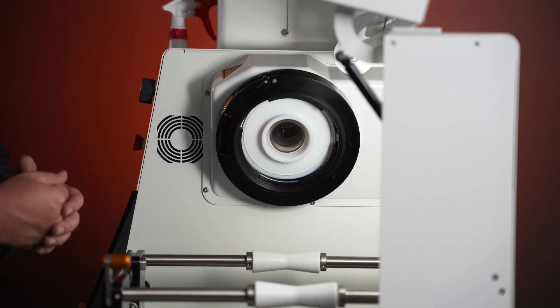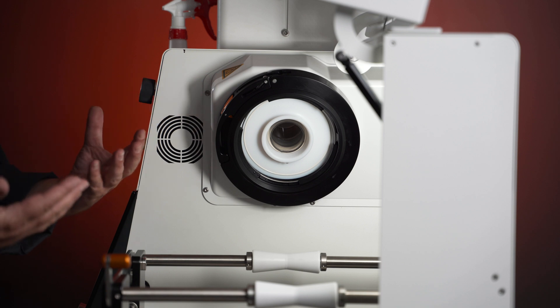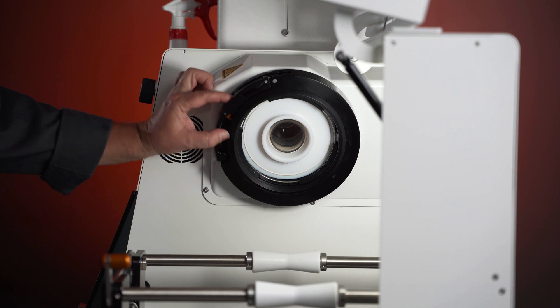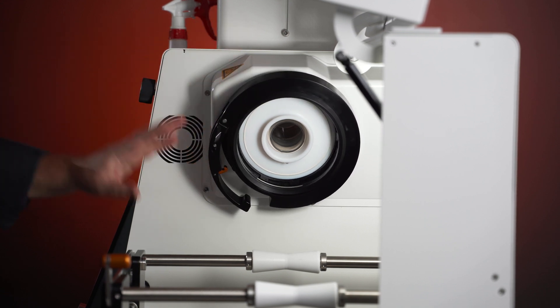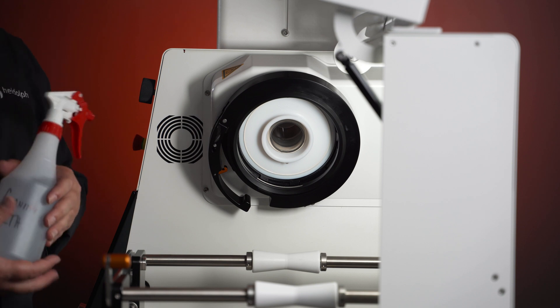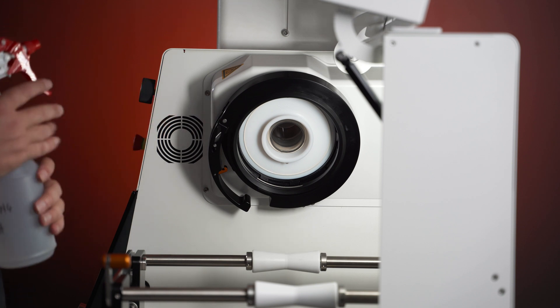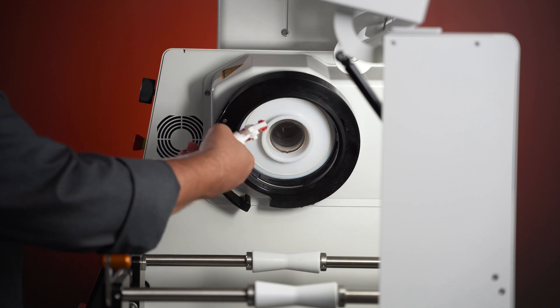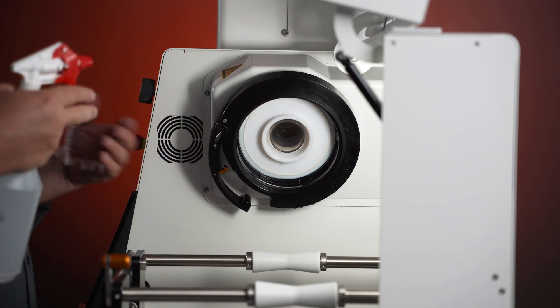The first process I'm going to go over with you on cleaning your locking collar is a daily cleaning that I highly recommend. Every time you remove your collar, it's going to be open. Just take some ethanol, isopropanol, or acetone — whatever solvent you use for cleaning in your lab — and just spray around the inside of the collar. Be pretty liberal with it.